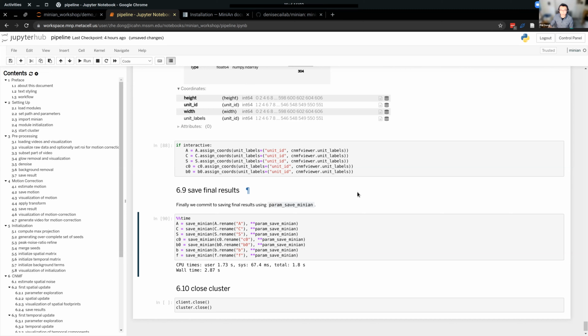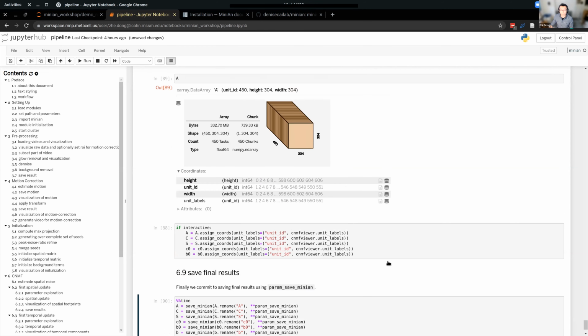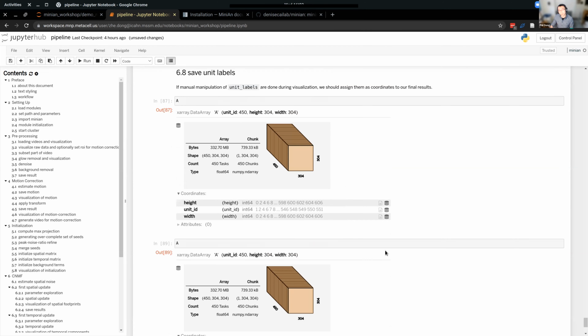Part of the reason we also chose a notebook is that for each session, ideally, you have its own pipeline notebook, and you have a record of every single thing you did for that session, all stored in a notebook. That's not really possible with batch processing.